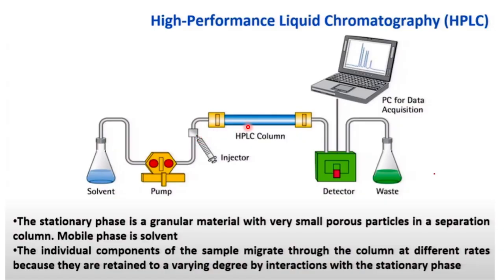After that, there is the HPLC column, through which the mixture of samples, such as a mixture of your polymers or different constituents, will be separated out, and here is the detector. Based on the interaction or on size, the different samples will come out at different times, and you will get the data based on that relevant time.